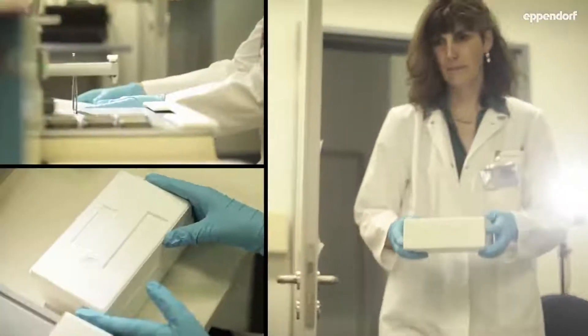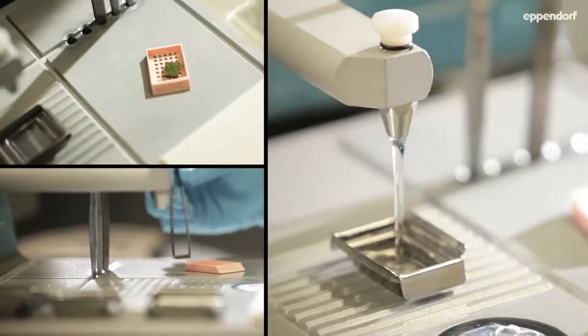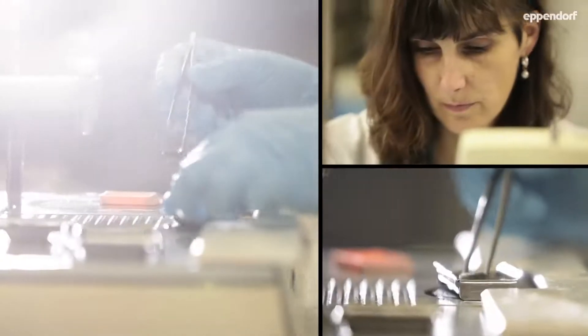We developed a method to extract proteins from formalin-fixed and paraffin-embedded tissues. This was not possible before.